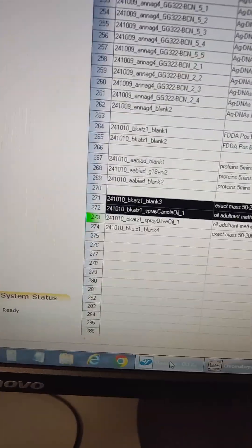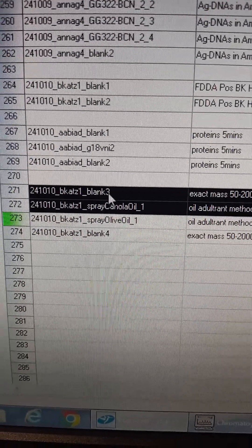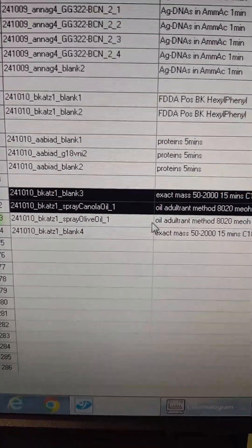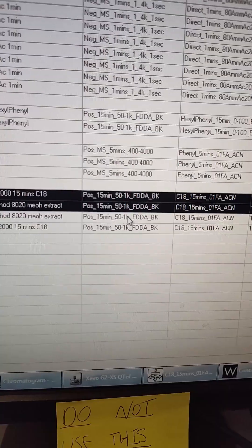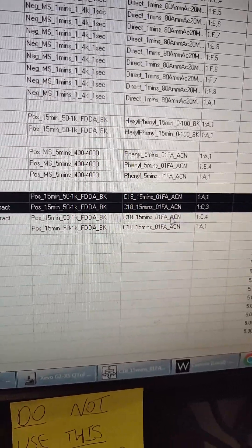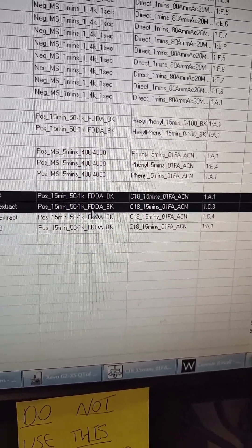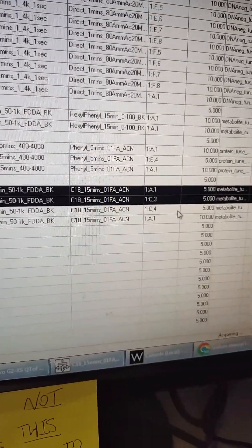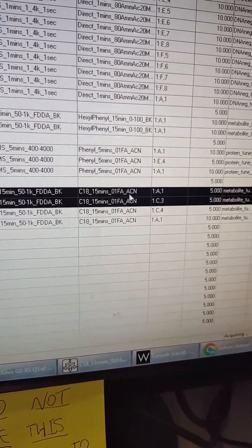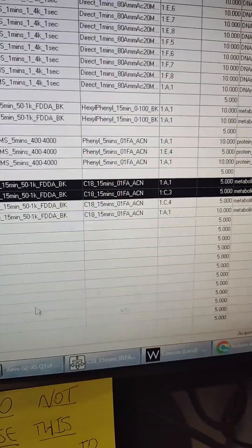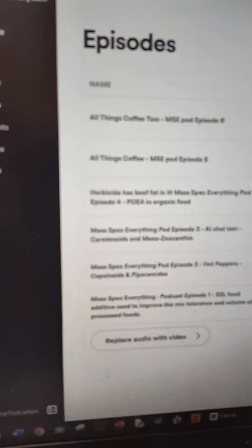And you can see here we're getting good data. It's already coming off here. We ran a blank, then canola oil, then olive oil for the adulterant method on the C-18 column. Fast DDA. So that is data-dependent fragmentation with my metabolomics method. This is about as good as you can get.